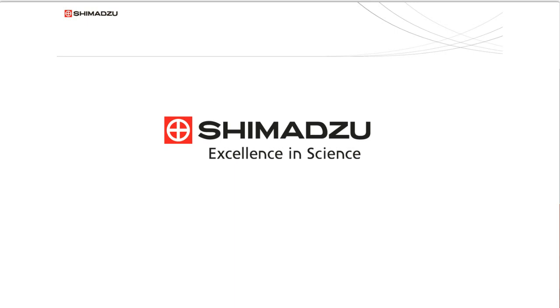Excellent. Okay, we have a question asking about acidic modifiers, and will that affect the peak shape of chiral compounds, or is there typically something used in lieu of an acidic modifier when running SFC conditions? Now, you can use acidic modifiers, or you could use basic modifiers. Typically, if the compound is acidic, you would use an acidic modifier. And conversely, if the compound tends to be basic, you would use a basic modifier.